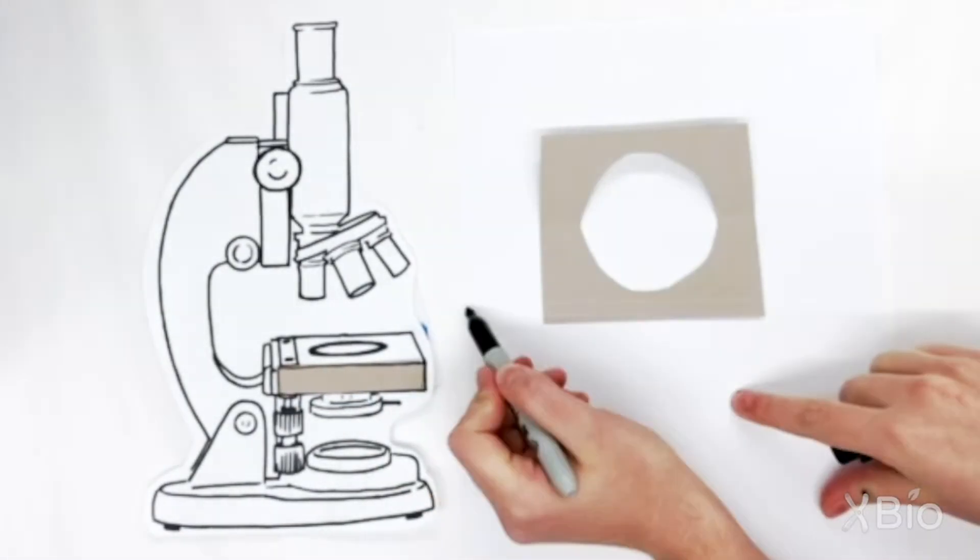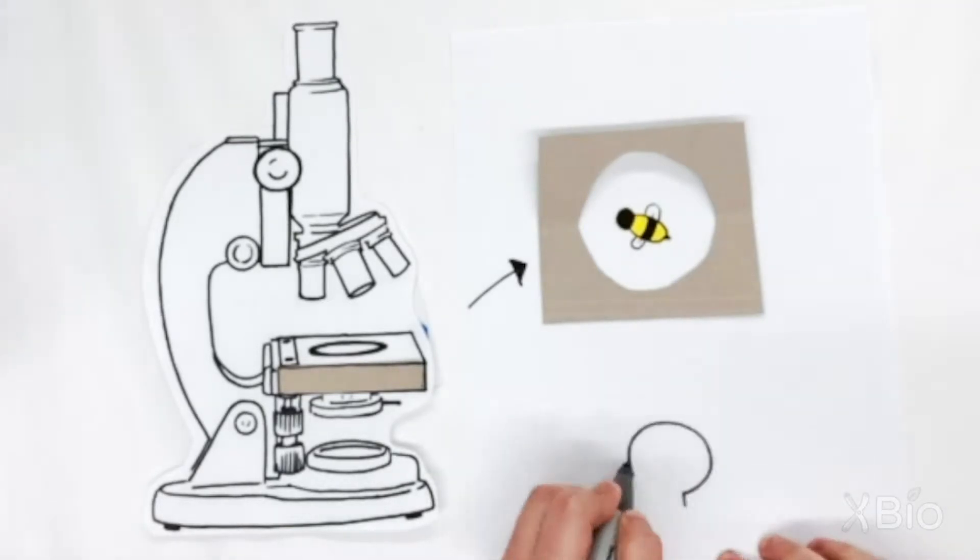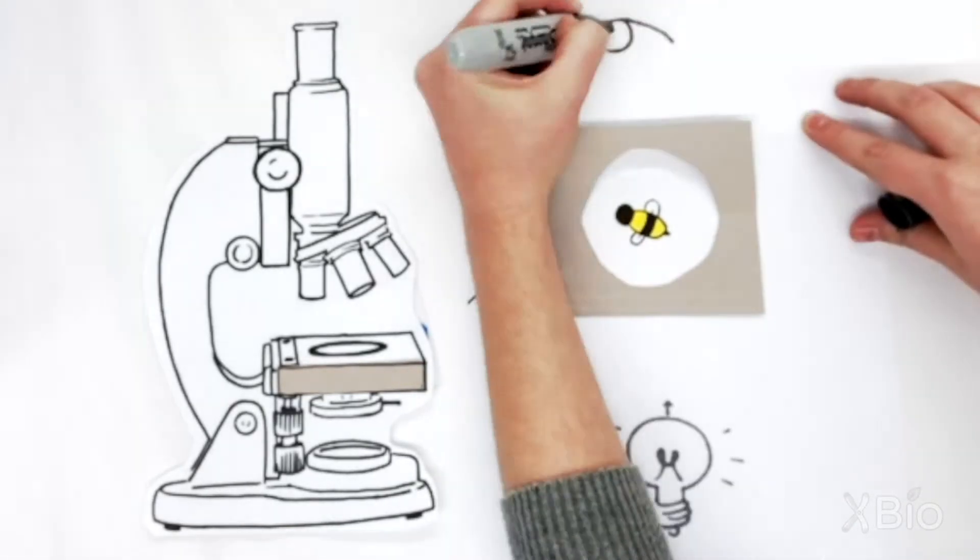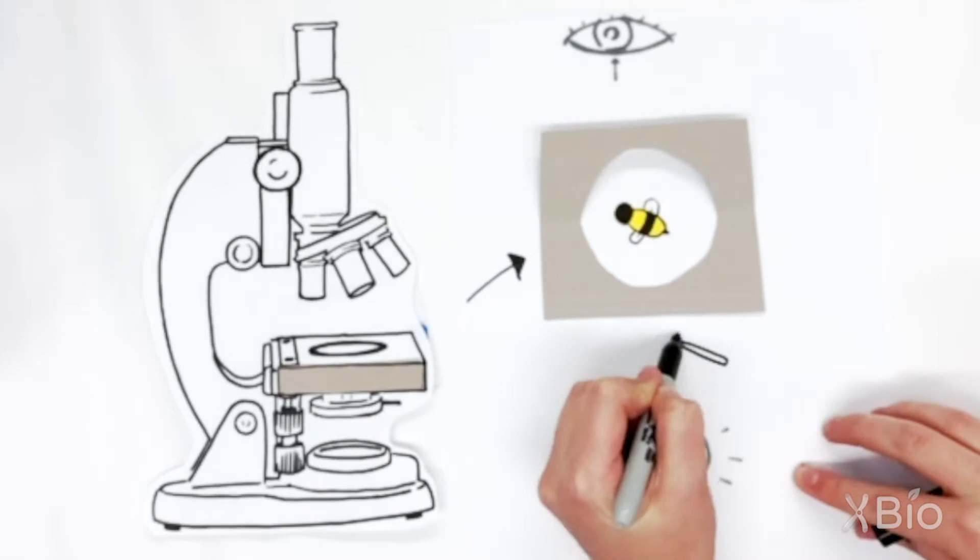You've got your sample on a stage, a bumblebee in this case. And a lamp sends white light up through the stage to your eye, with some lenses for magnification in between.